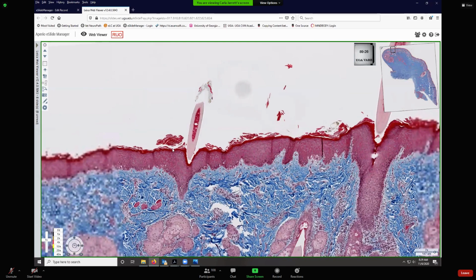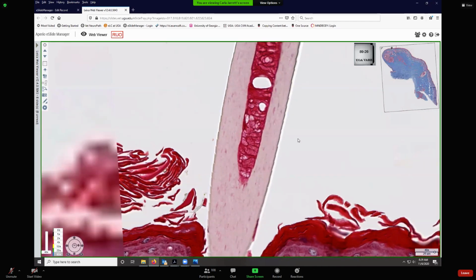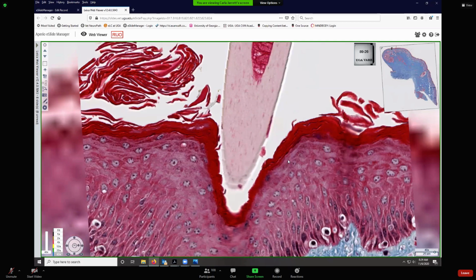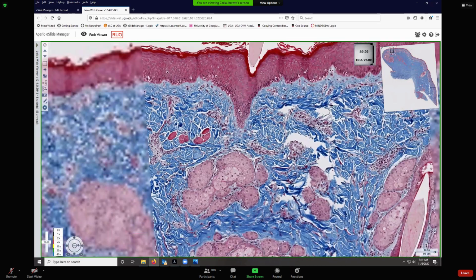Okay, so over here, this one, you can see that cuticle better. It actually will come into view. So see how it looks like the shingles on a roof? And notice that the little edges of the overlapping shingles are pointing upwards. Here you can see that little edge is pointing upwards towards the skin surface. Okay, and there's a reason for that. And we'll look at the reason why in just a minute, why those would point upwards.